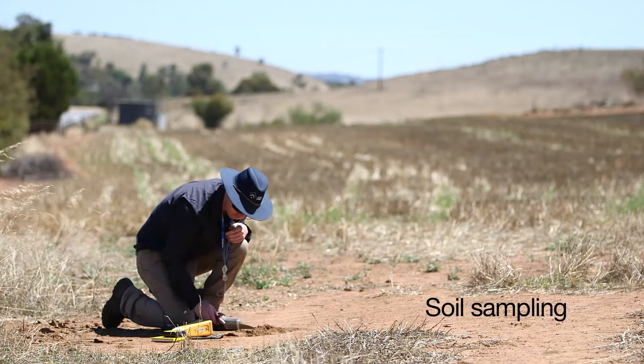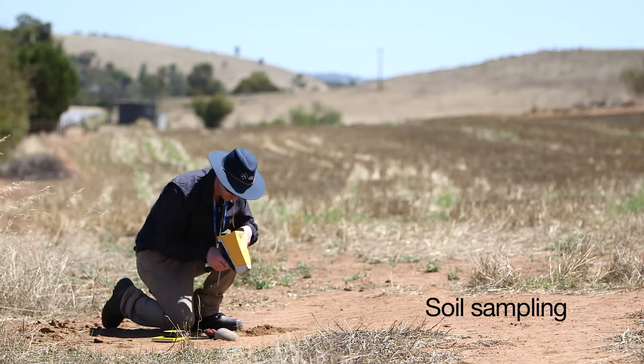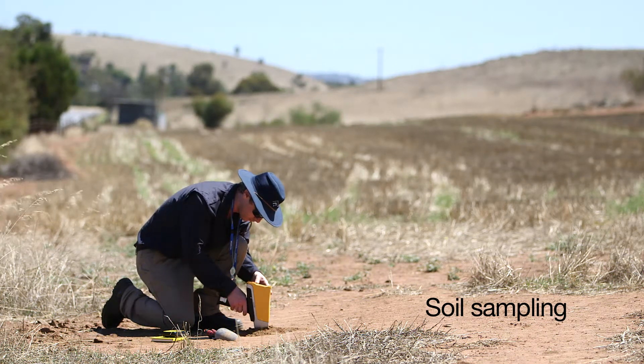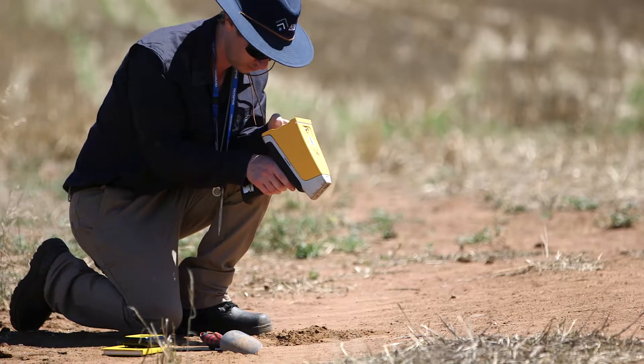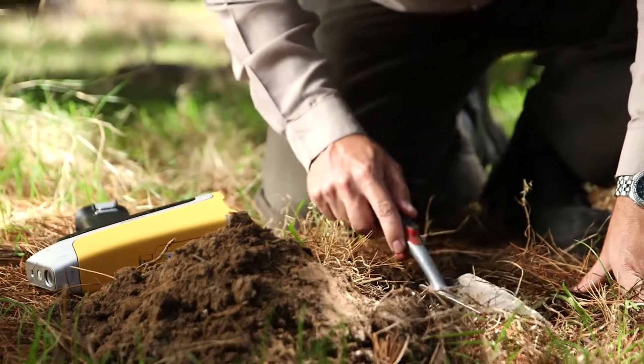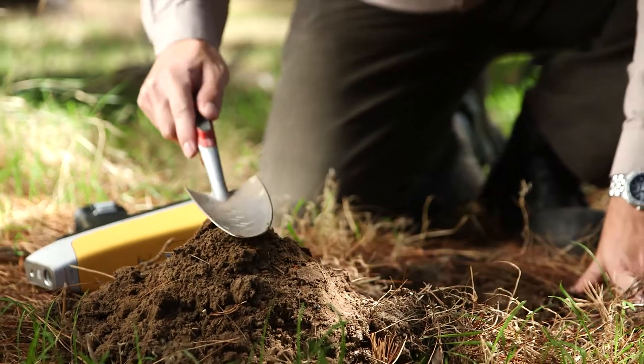XRFs are generally used in two ways during the soil sampling phase. Most often, grids are set up where samples are collected on a grid spacing which will vary depending on the commodity they're searching for and the project. They will go around with the portable XRF, take samples from the top, potentially digging past the A or B horizon.